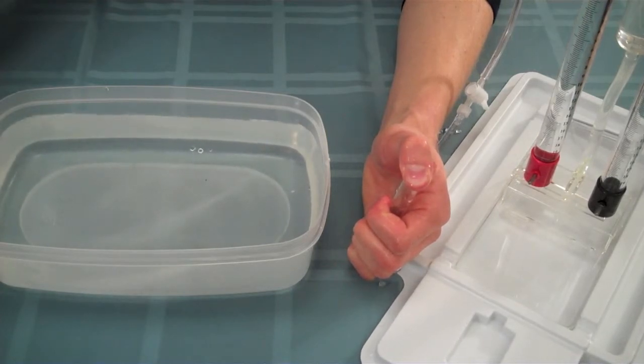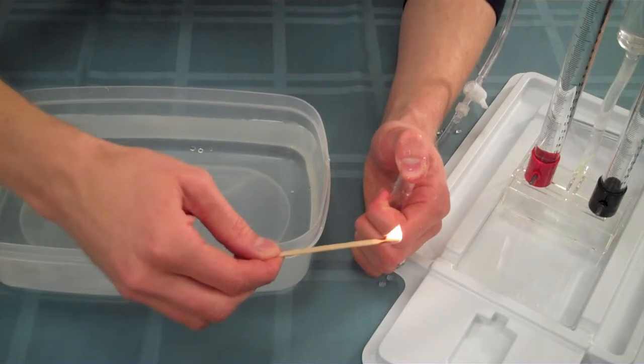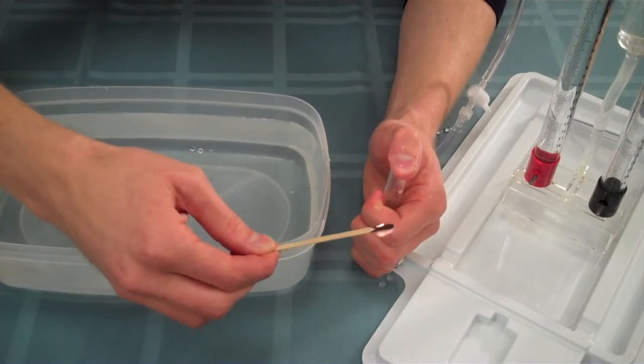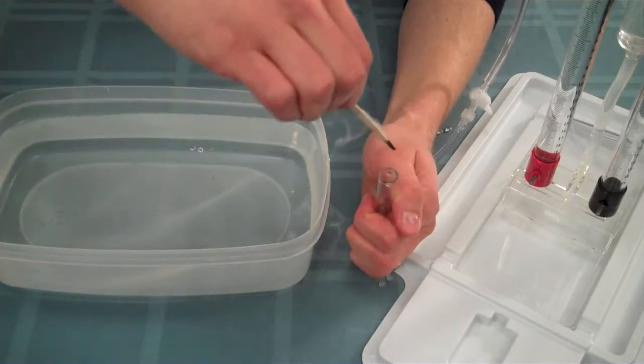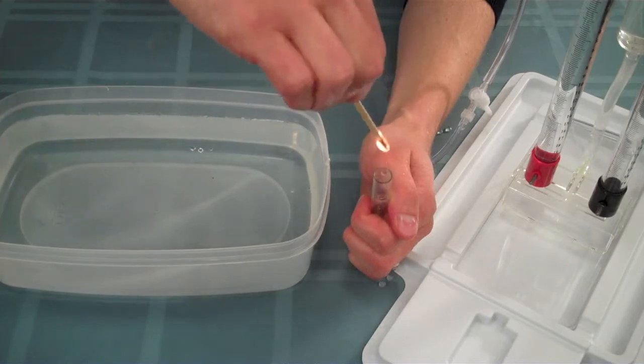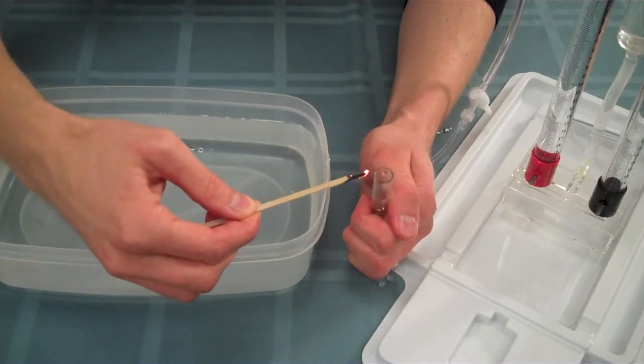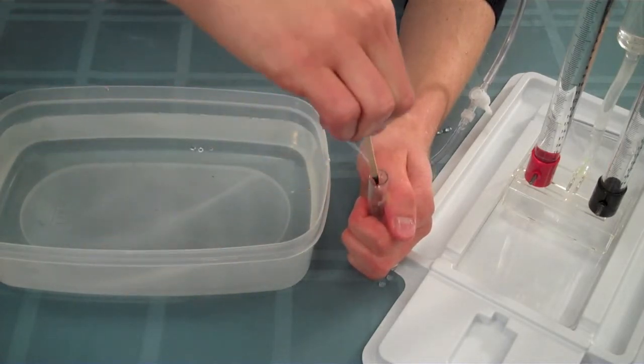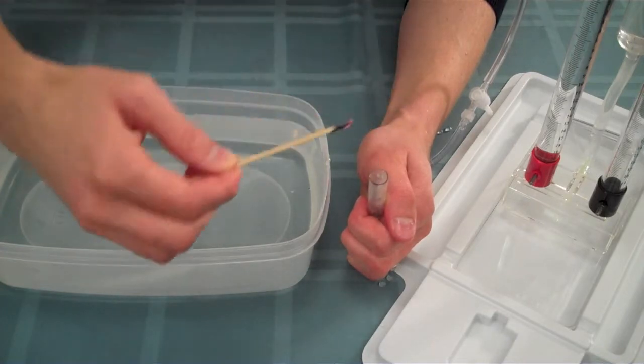Light a splint, let it burn for a moment, then blow it out. While the splint is still glowing, remove your thumb from the test tube and insert the splint. It should reignite. This result indicates that the gas that was in the storage column must be oxygen.